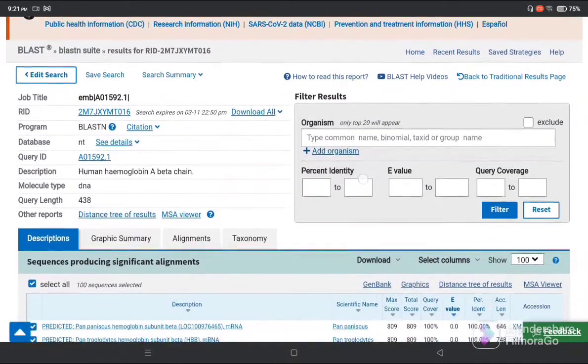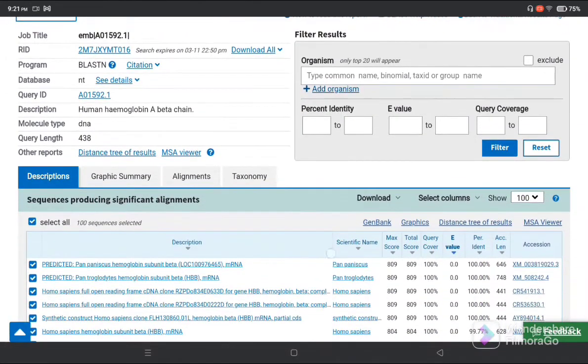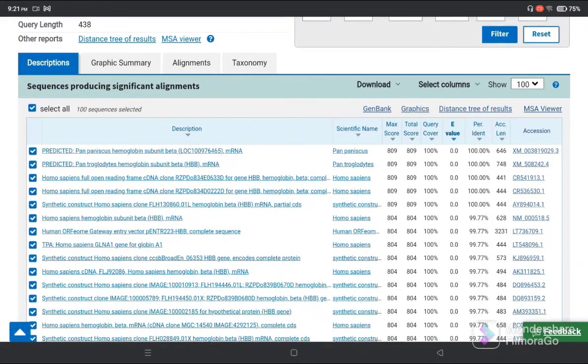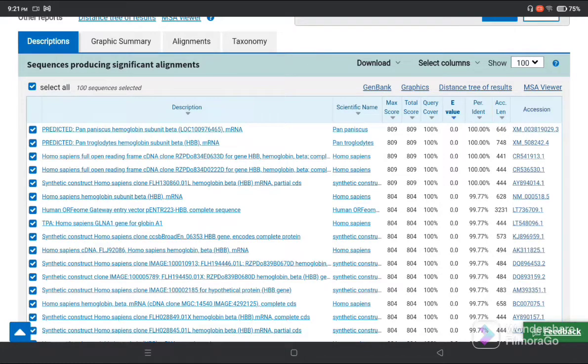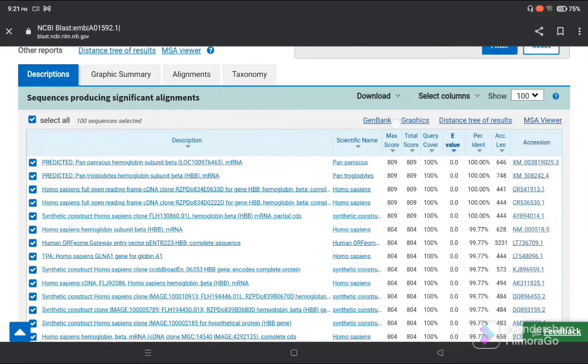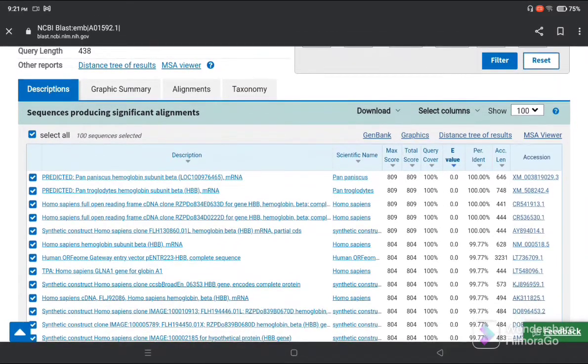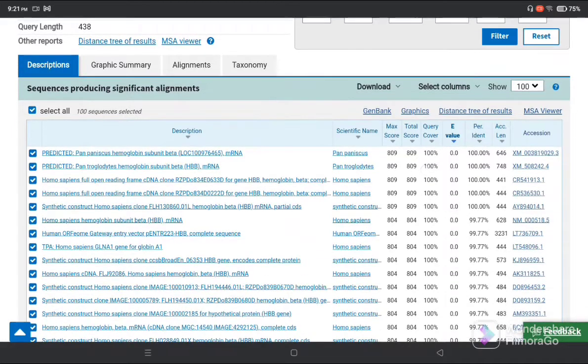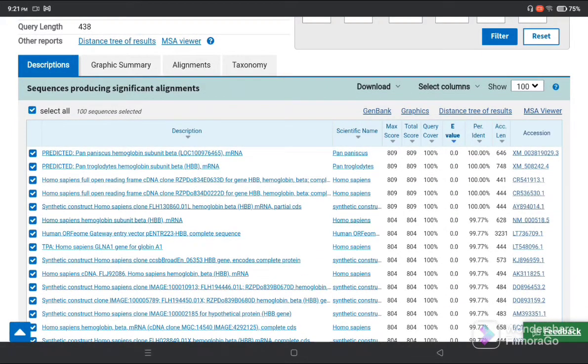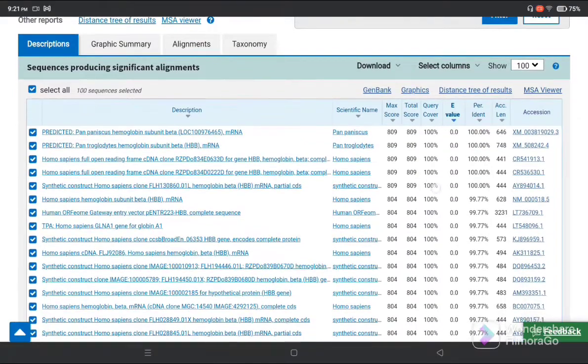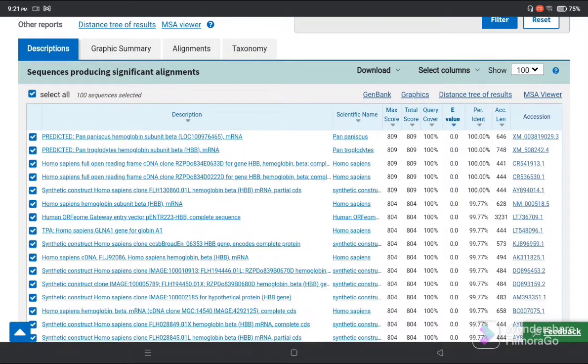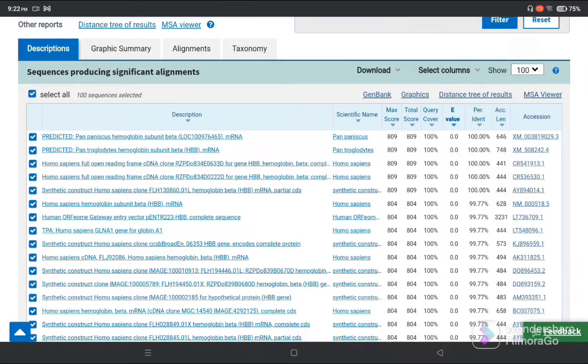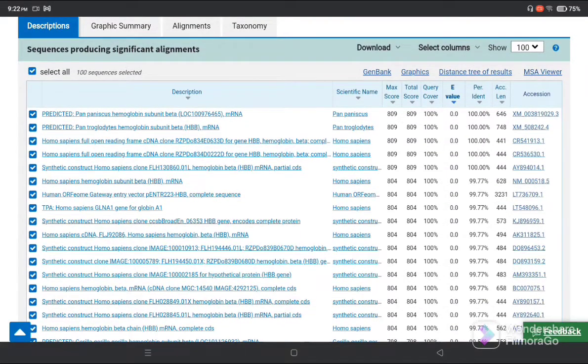Now you can see our human hemoglobin A beta chain has appeared. First is the description. You can see that our sequence is related to the database sequence present in NCBI. You can understand by looking at the maximum score, total score, query cover, e-value, and percent identity. The maximum score is 809 with hemoglobin subunit beta mRNA. Query cover is 100%, e-value is 0.0, and percentage identity is 100%.